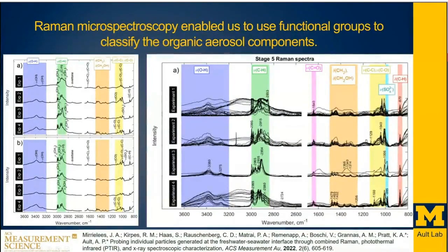But we do have the occasional problem of a particle that has a fluorescent background, or something that is going to really be kind of a challenge. You can see that particularly here, in this last experiment, we added some biological material to the sample, and you can see that we really started to have a large background issue.